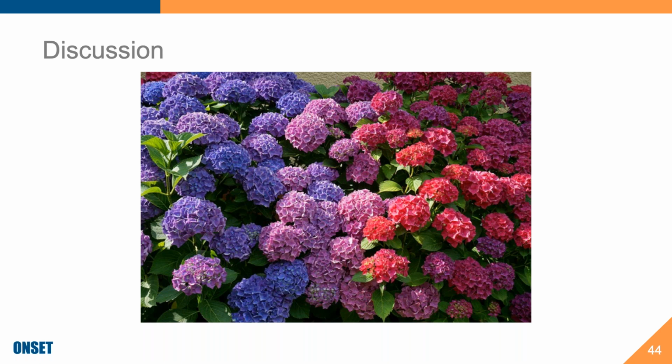Some people are using nothing. So Onset has our copper guard, which does mitigate biofouling. But when it comes down to sedimentation fouling, our recommendation for best practice there is to go out there and clean it as often as you can, or as often as necessary. I know, I wish that were a better answer, but that's sort of what I have now.